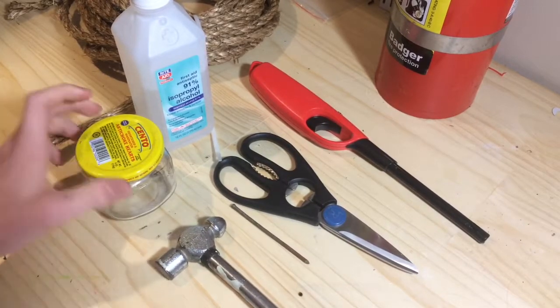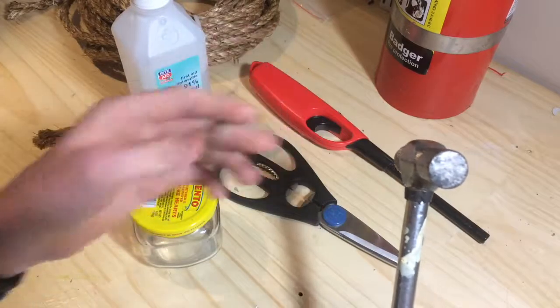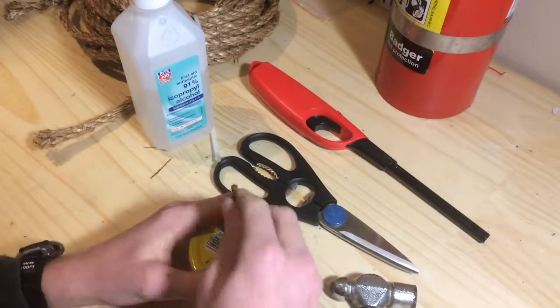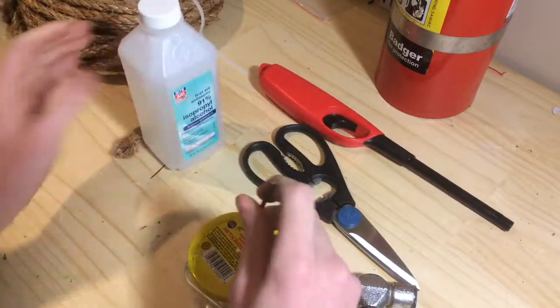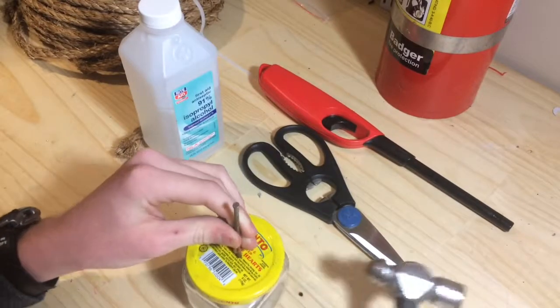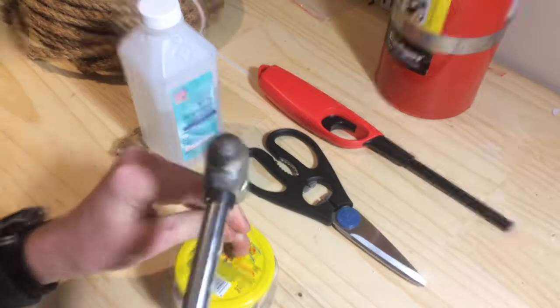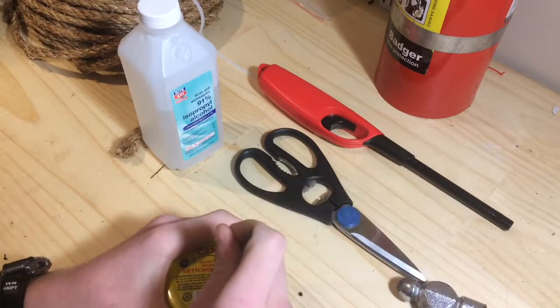First, what you're going to want to do is take your hammer and your nail, find the center of the lid, and make a hole in it. Now obviously the rope can't fit through one hole, so you're going to need to make a couple of holes. Make sure to be careful so that you don't hurt yourself with the hammer or the metal.